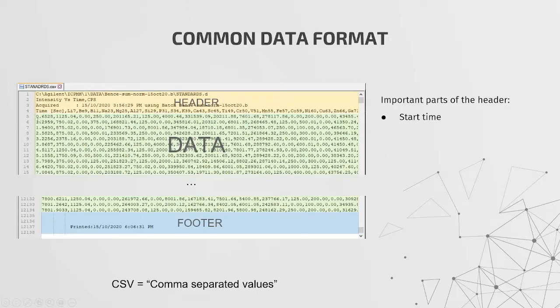So this is the first measurement, which has a timestamp of 0.65 seconds. The next one has a timestamp of 1.3 seconds, and so on and so forth. But we can't use that to plot our data in the overall scheme of things because it's just an elapsed time since the file started. So we need this timestamp up here to be able to place these data in context.